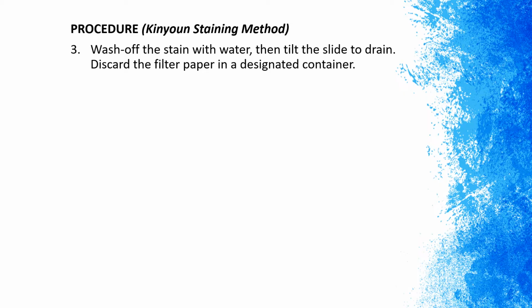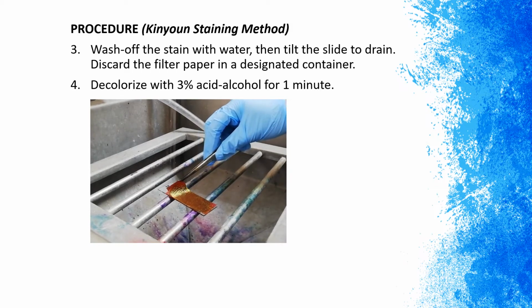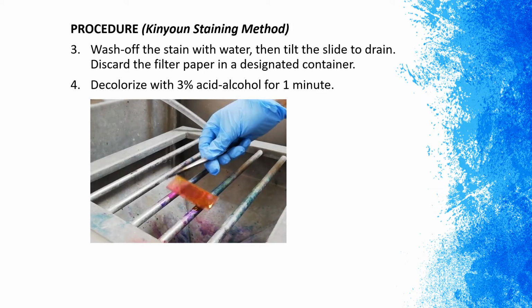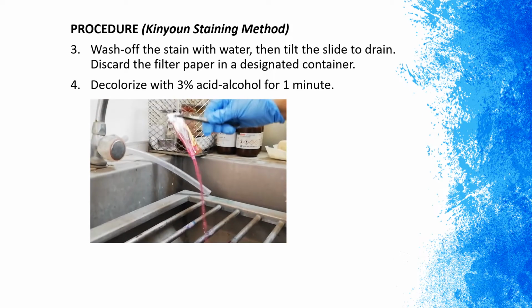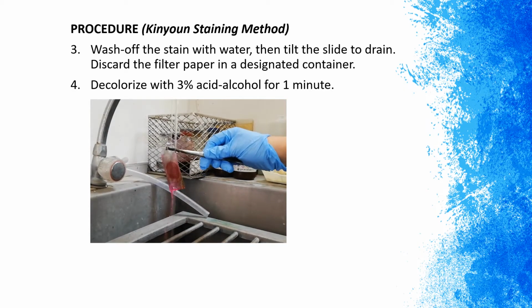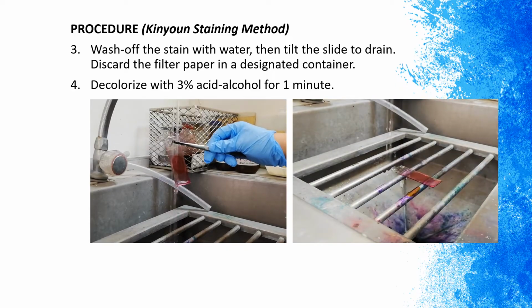After that, wash off the stain with water, then tilt the slide to drain. Discard the filter paper in a designated container. So you wash your slide with running water and then decolorize with 3% acid alcohol for 1 minute.